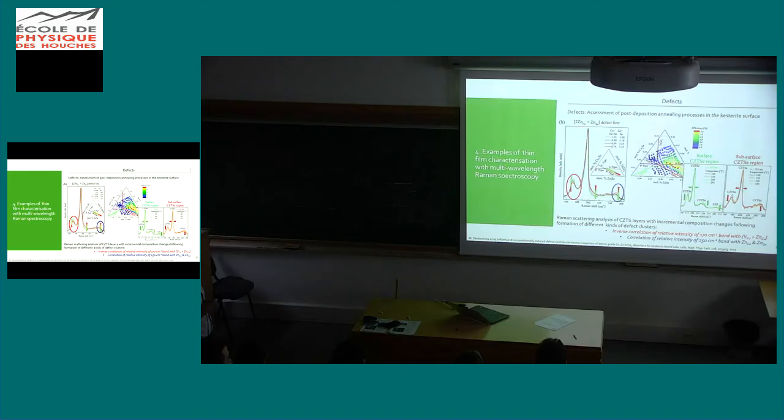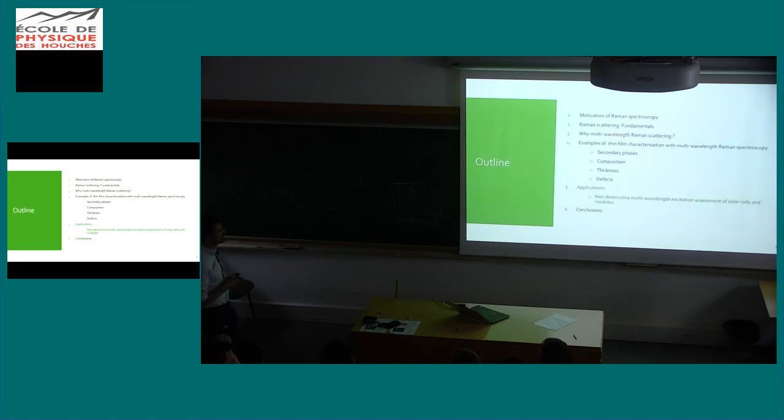And finally, much more complex but also possible is to assess the defects. For example, this is the typical selenium kesterite Raman spectrum, and this peak corresponds to copper selenium vibration, this peak corresponds to zinc selenium vibration, and this to tin selenium vibration. So if you touch copper in your composition, or zinc or tin, you will always see modification here. This corresponds, for example, to this kind of cluster of defects. Then you can know if you increased the quantity of some important defect for your material. You can see here how these peaks can be moved, just adjusting the composition of your material. So this is much more complex, but can be possible as well by Raman spectroscopy.